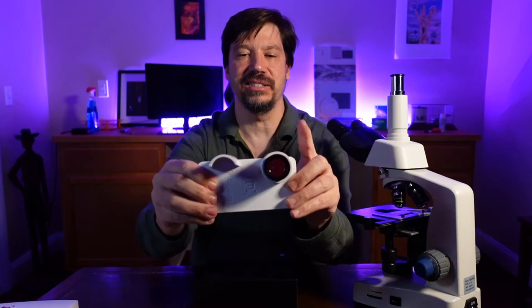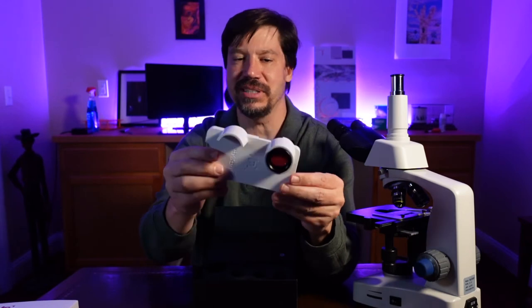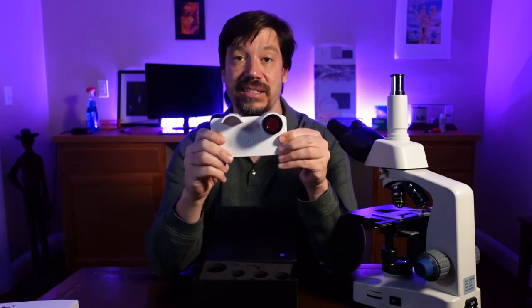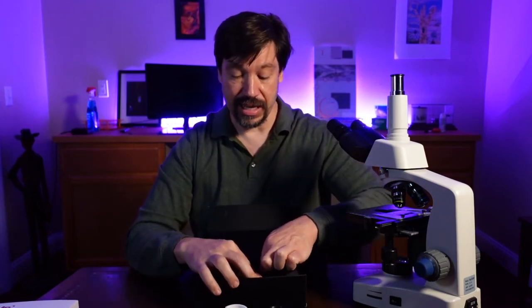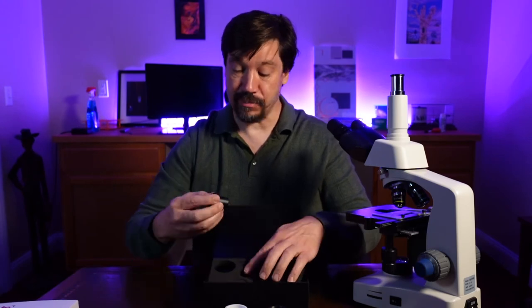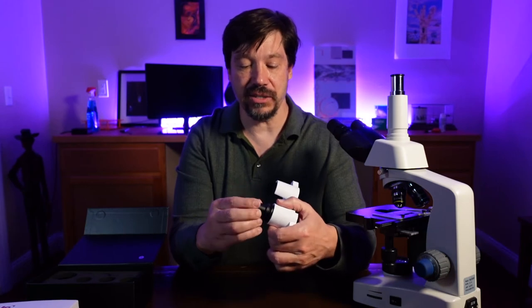Here is the device — it has a lens over here and a support over here. This sits on the other ocular and provides a nice solid platform, making it so easy to use. The iPhone is not flopping around or moving, as is the case with other devices, so it's a really nice easy ergonomic device. In addition, we get screw-in adapters that allow you three different ways to connect the LabCam to your microscope. I'm going to use the adapter designed to go into the port where the ocular sits — I just remove an ocular and add the LabCam in. It's a nice solid metal piece that just screws right into the lens.